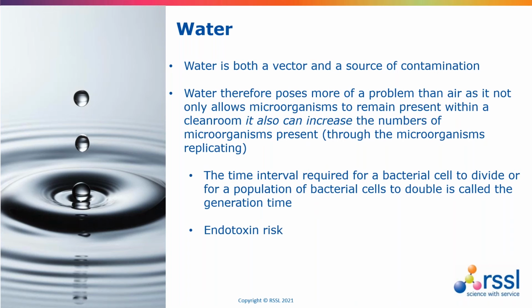So with water, one of the key issues is controlling time, because the longer something stays wet, the greater the chance there is for organisms to divide. And those of you familiar with the way that bacteria divide through binary fission know that it's by a multiplying effect. So as we start to go beyond an hour or 2 hours, then that risk is compounded. And then also, if we have gram negatives and they die, we also have endotoxin risks as well.